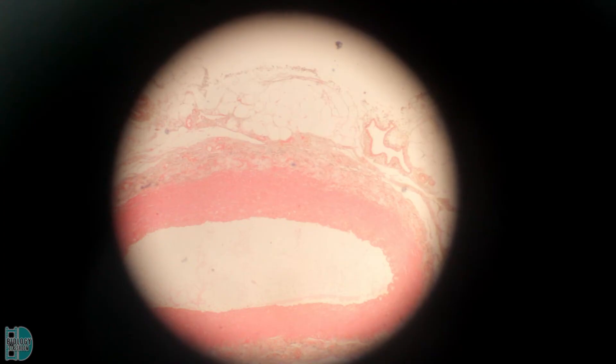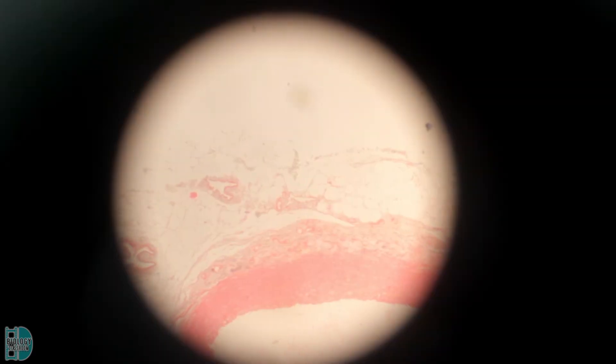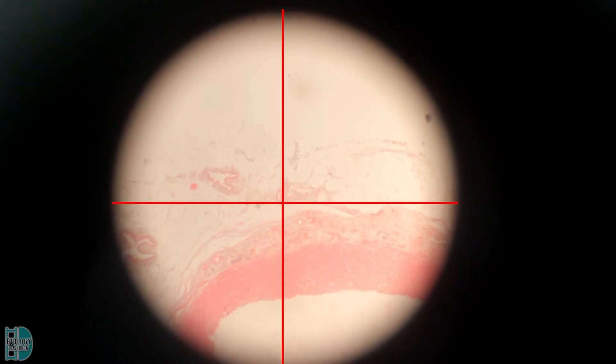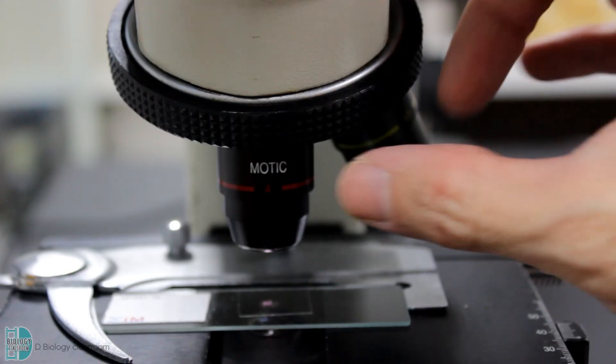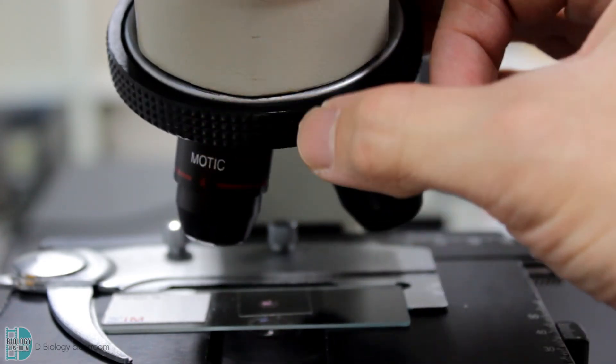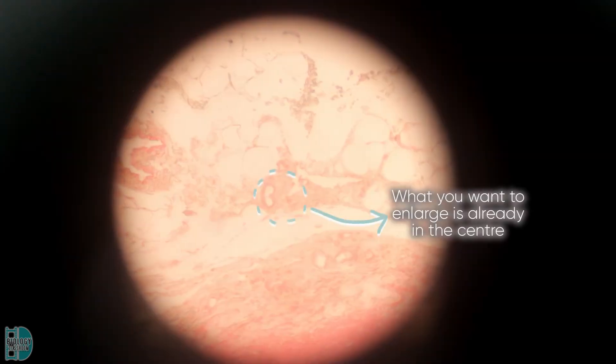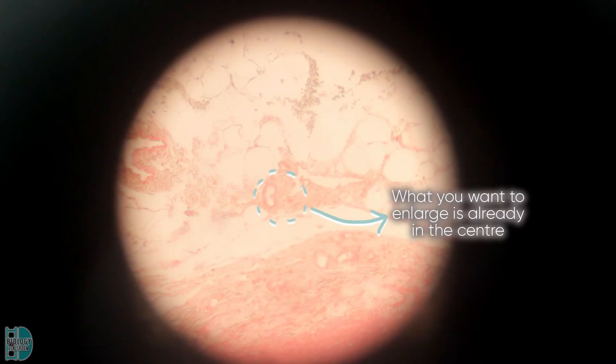You can now use the stage control to move the specimen around. If you need to enlarge a particular part, place that part in the center of the field of view. Use the revolving nosepiece again to change to a higher power of objective lens. The structure you want to see will be in the center of the field of view, so you don't have to move it much.